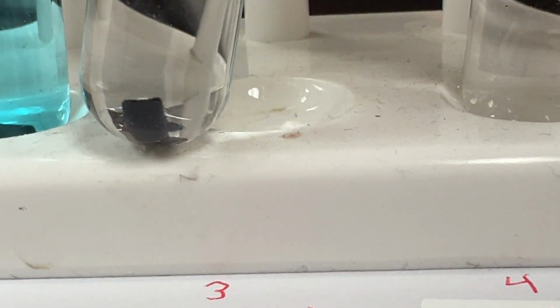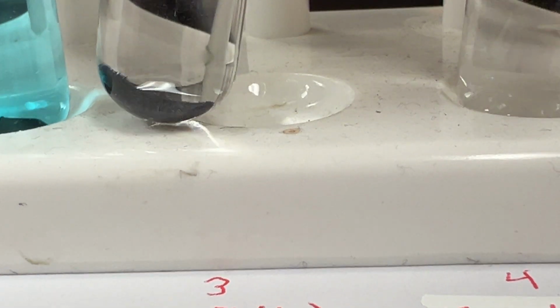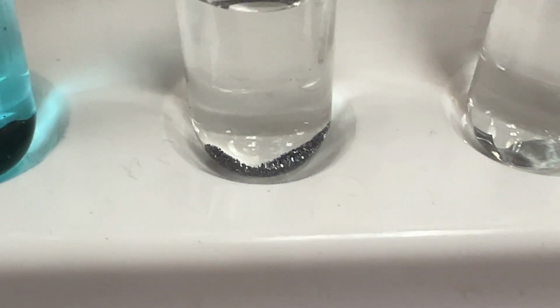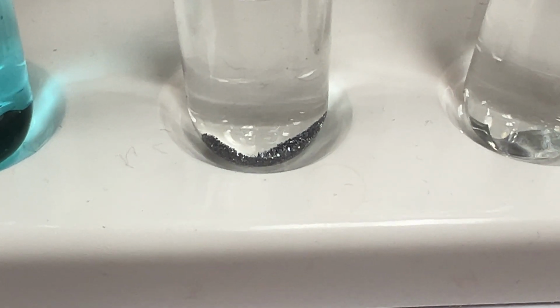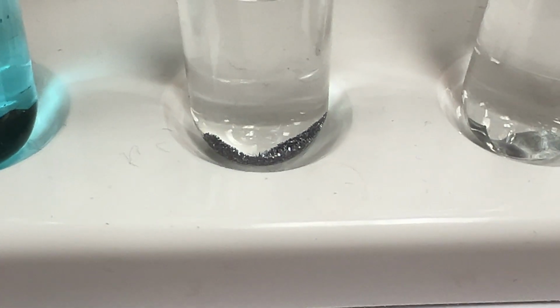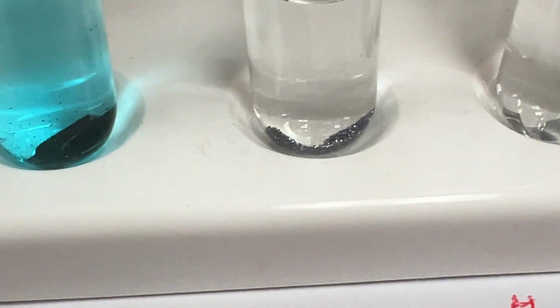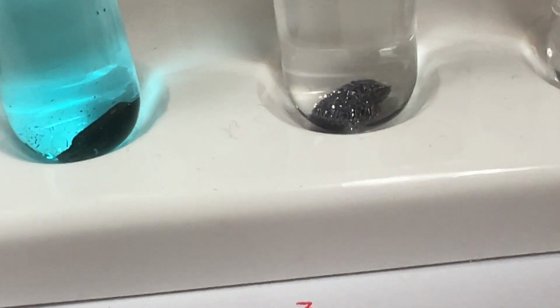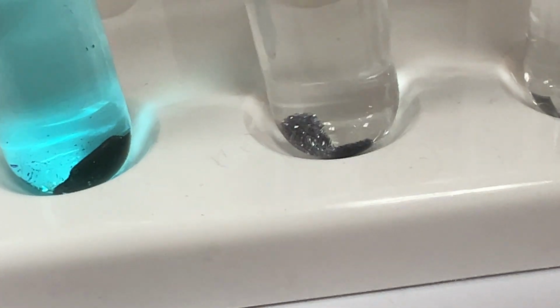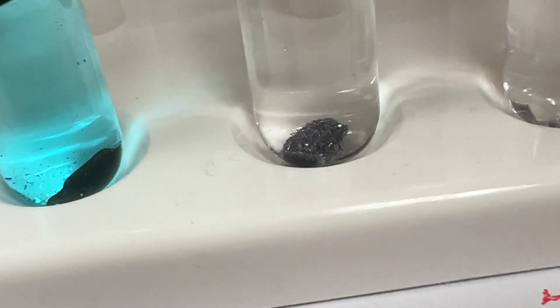There are little shiny things forming on that. And let's just take a look at this one. If you look in there, there are little shiny crystals that are now forming on that piece of zinc that was there. So something is definitely happening. I switch this around, you can see how beautiful they are. So what are those crystals? What are they made out of?